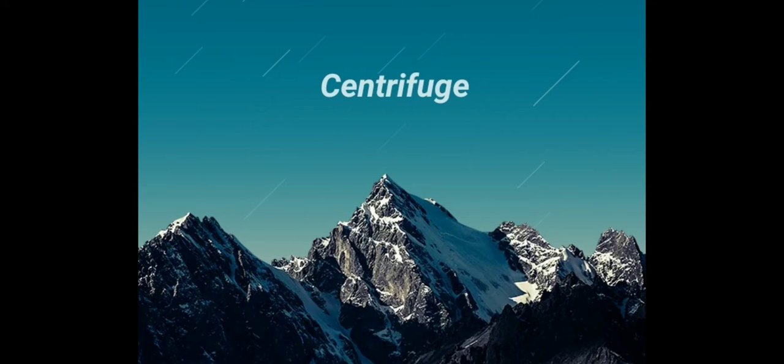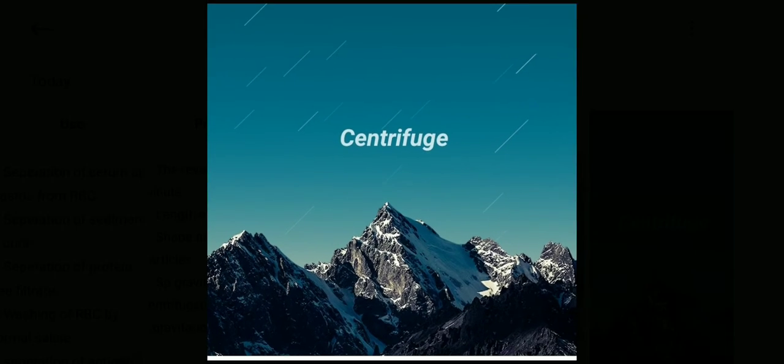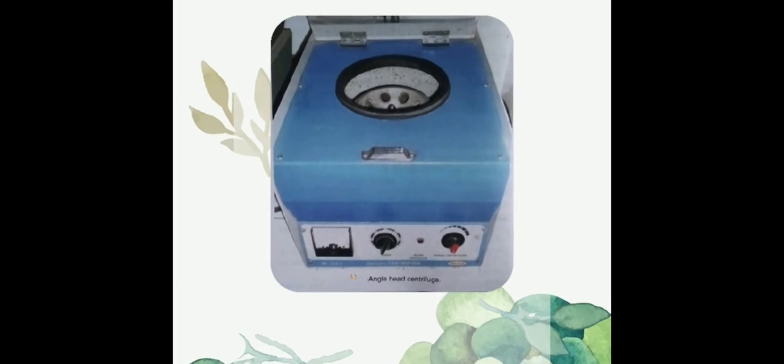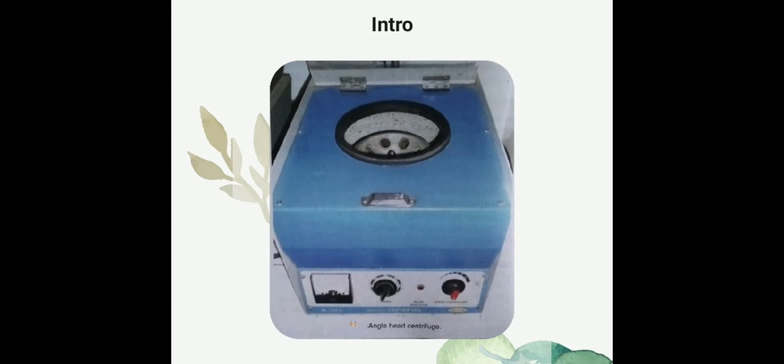Today's topic is centrifuge. Introduction. Centrifuges are designed to accelerate the sedimentation process by using centrifugal force.